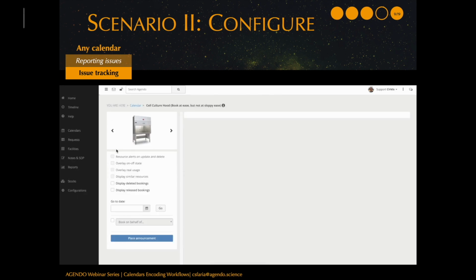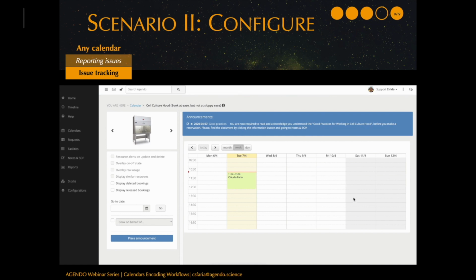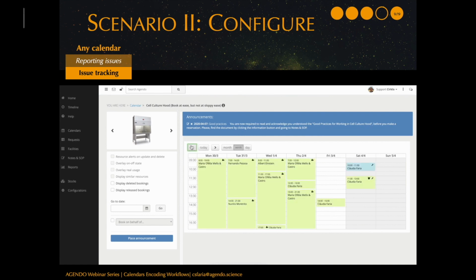Now you can see that the calendar is restricted only for the time that I've set. However, I do know users like this staff user that are well behaved and take the most profit of using my facilities out of working hours when no one is around to distract them. So this wouldn't be really fair or flexible unless I grant them access permissions.